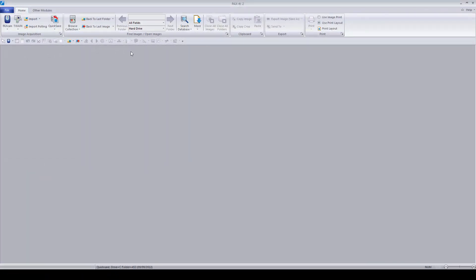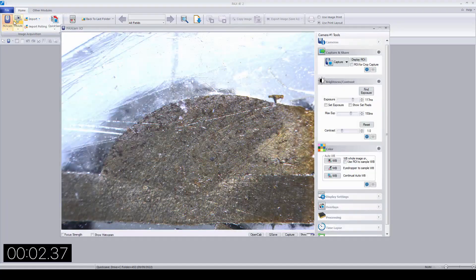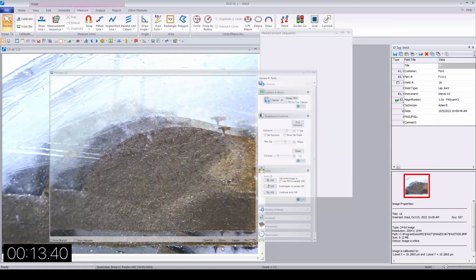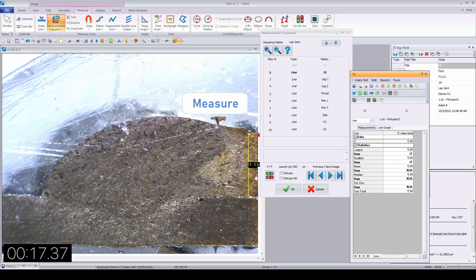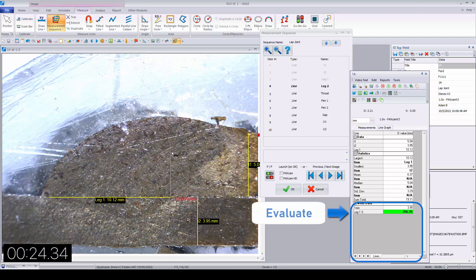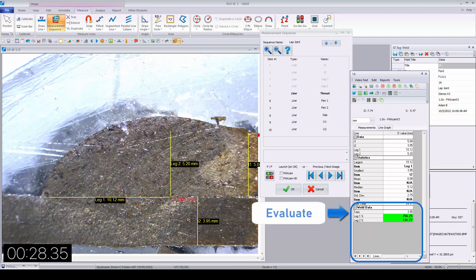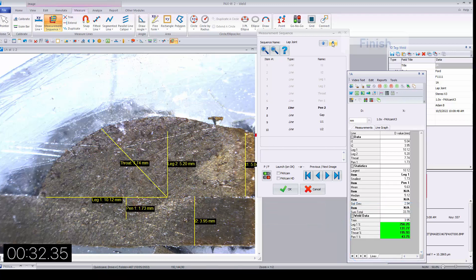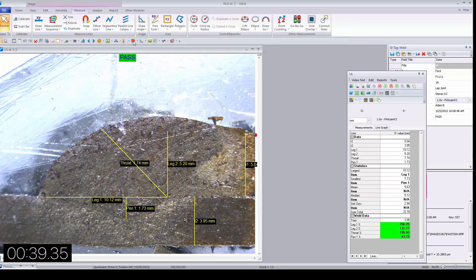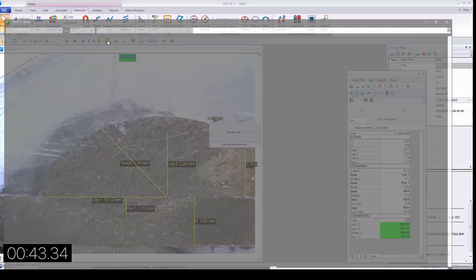Now that we know the principal parts used for cutting edge inspection, let's put them into action to demonstrate the intuitive, repeatable operator workflow that results. Let's launch PaxCam, capture an image, enter data, begin measuring, evaluate your measurements and results, finish measuring, confirm pass or fail, report, complete.